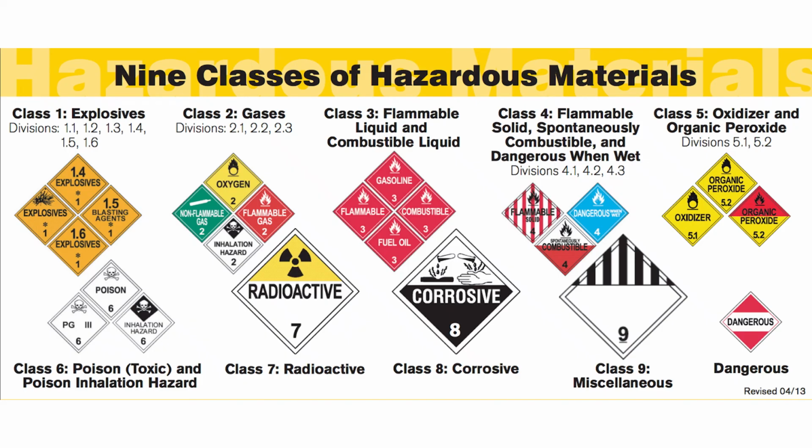This diagram here, class, shows the 9 classes of hazardous materials. So kindly memorize them.